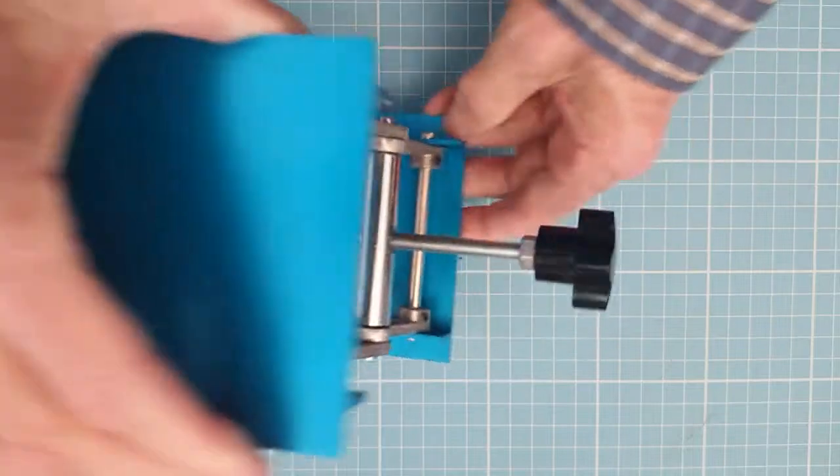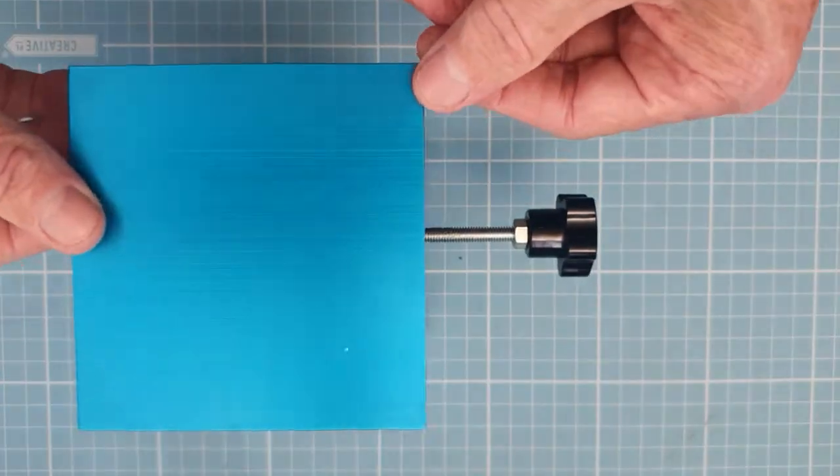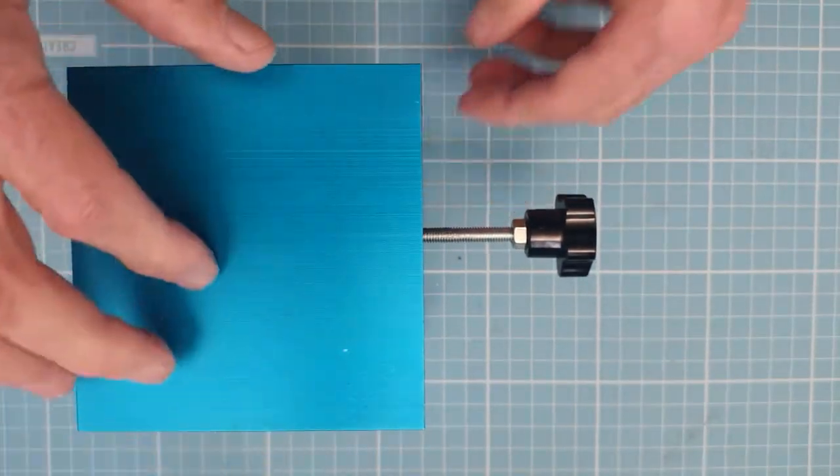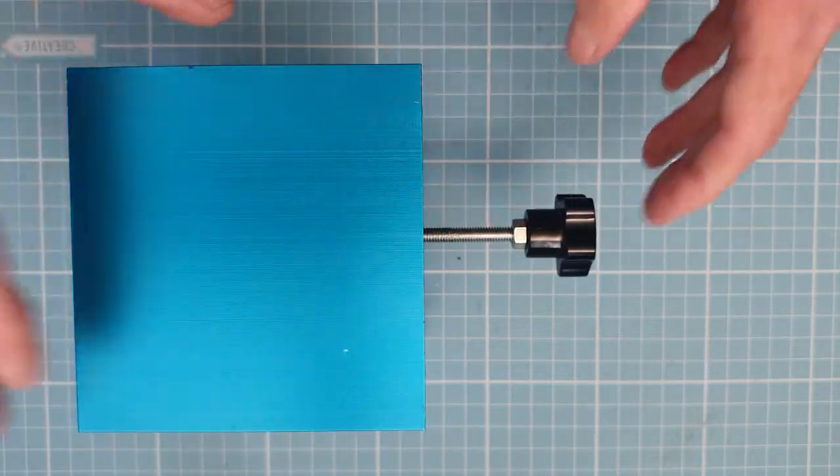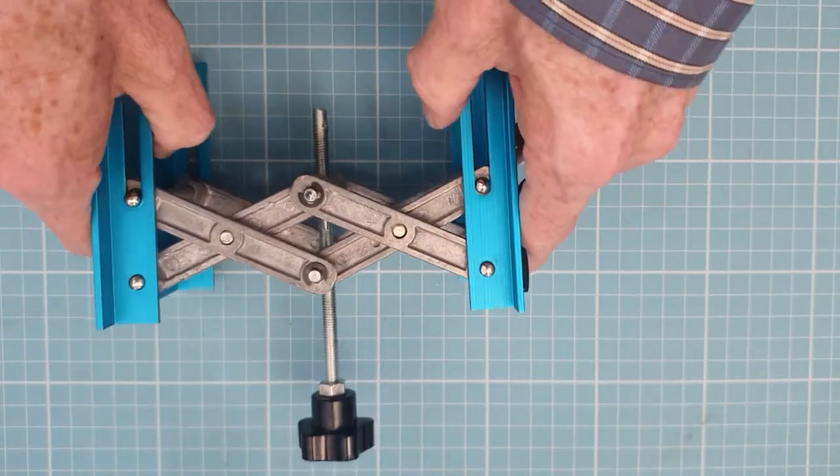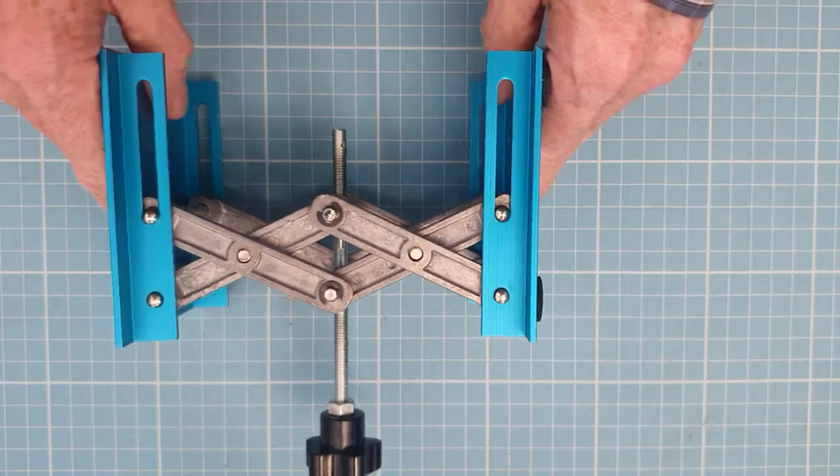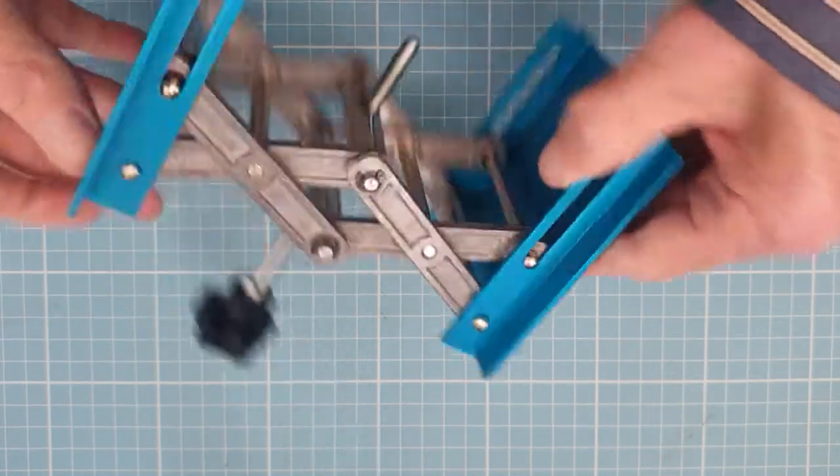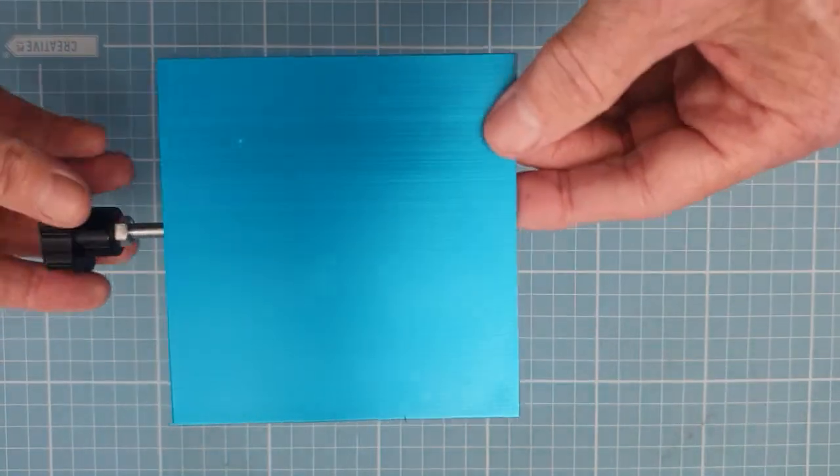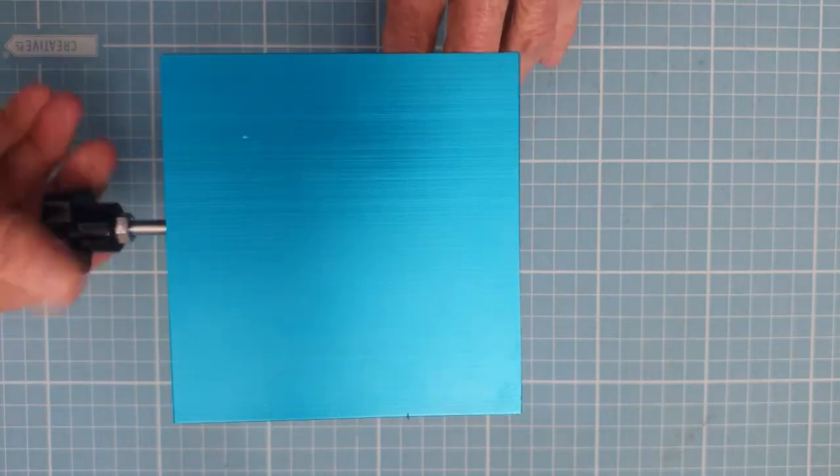That's not a concern—it's actually quite stable if you're not trying to move it. It'll just assume a stable position. Although, as you can see, it's not completely solid, I haven't found that to be a problem.